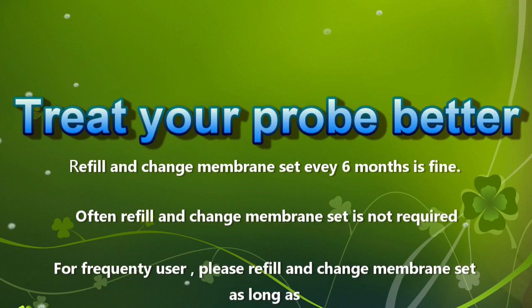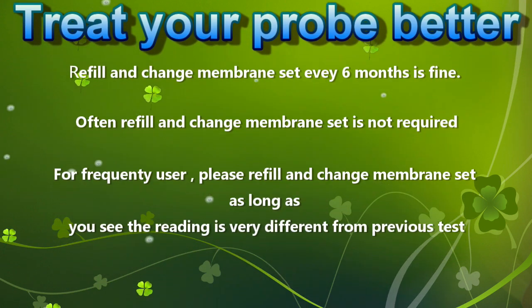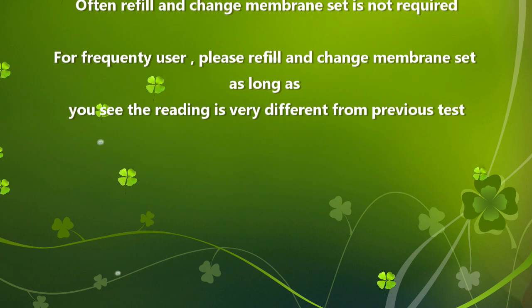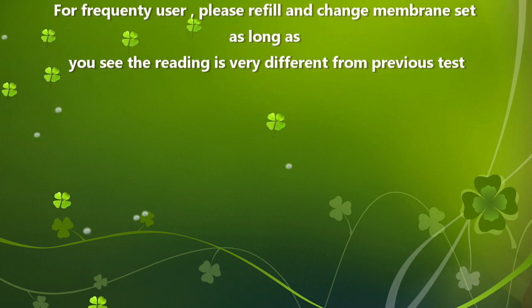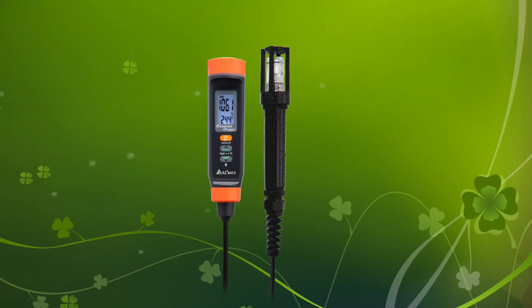Currently, unscrewing the membrane set and adding electrolyte will not help the measurement. If you are a frequent user, even if it is less than half a year, when the difference between the measured value and the previous time is too large, please replace the membrane set and inject electrolyte.